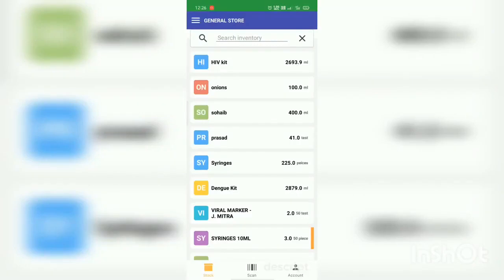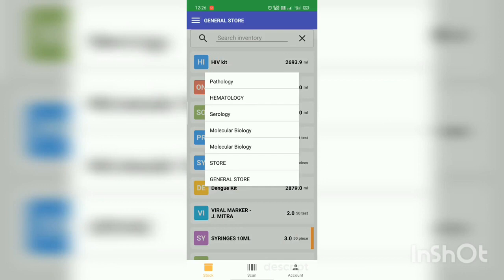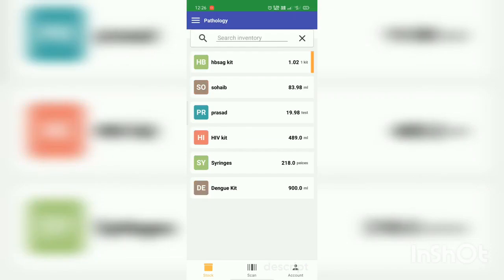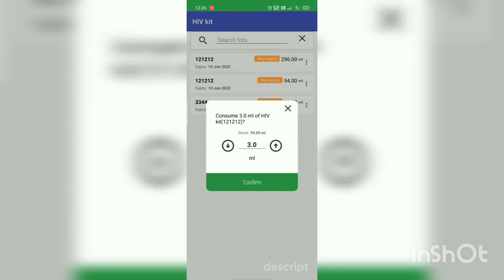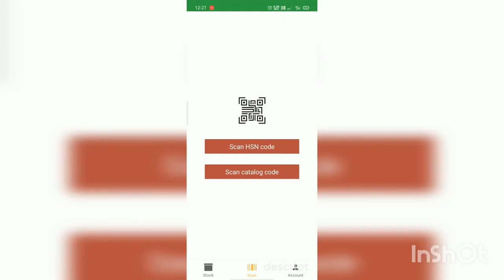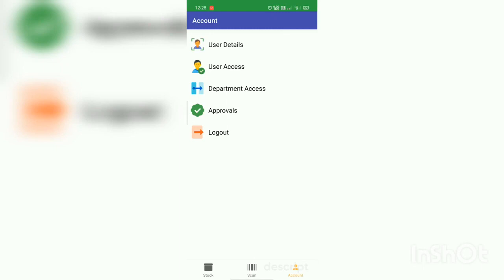You will be able to easily monitor your inventory by using our Krelia Health inventory mobile application. In stock, you will get all the stock details. You can also get different department-wise stock details — suppose you want details for the pathology department, click on it and you will get all the details of that department's stock. If you click on a particular stock, you will get its details. You can also manually consume the particular stock — click on the lot, click on consume stock, select the quantity, click on consume and confirm. We have consumed three quantities of HIV. By using the scan feature, you can scan the barcode to consume a particular stock or get details of that stock. In account, you will get details of the account.